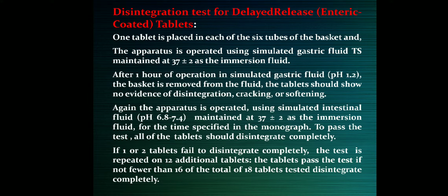After 1 hour of operation in simulated gastric fluid, the basket is removed from the fluid. The tablets should show no evidence of disintegration, breaking, cracking or softening.